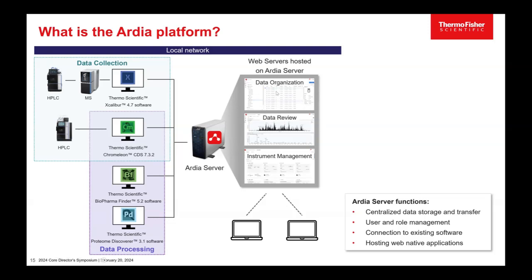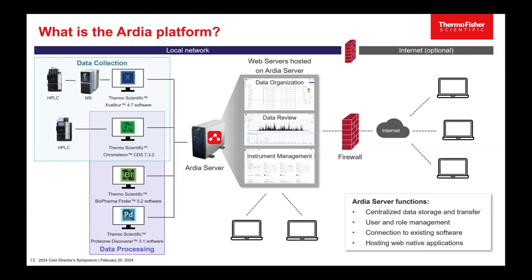Now, there's the Data Explorer application, kind of like OneDrive. This is where you can upload data, download data, and control access to different parts of the data system. So if you want to share a result with a collaborator, you can give them access to that one folder, and that's the only thing they're going to see on Ardia. So you can use it kind of like OneDrive to share data. And if you have access outside the firewall, you can put something out on the internet. You can share data files and information out to collaborators outside.